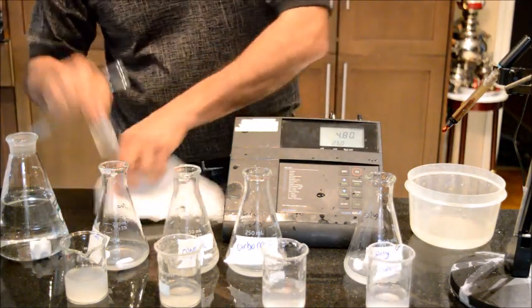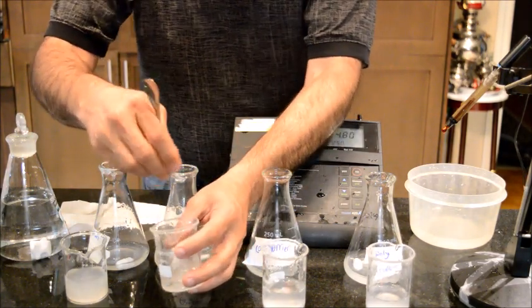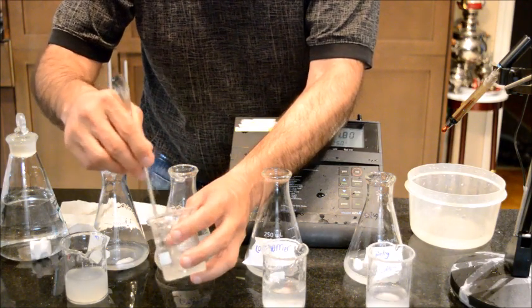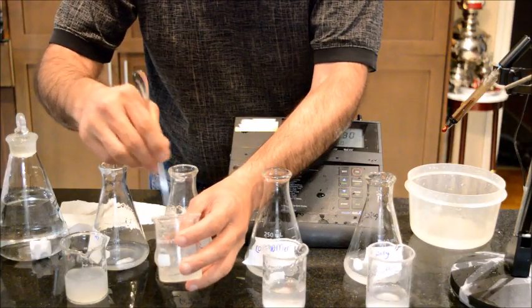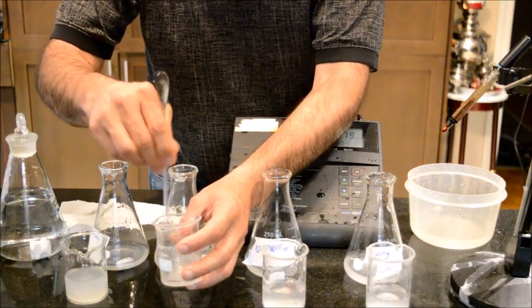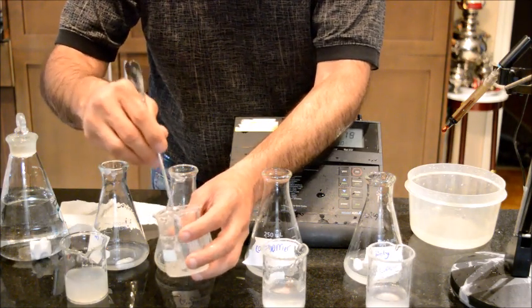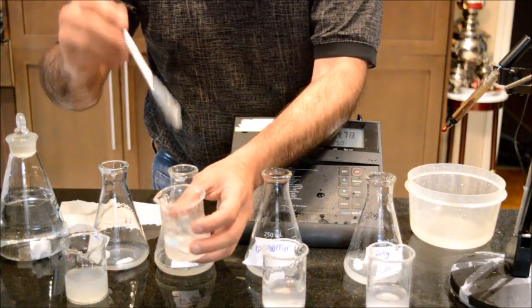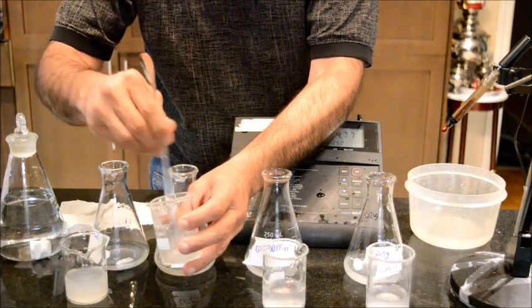I'm just going to switch to alginic acid, and in the case of alginic acid, it is rather picking up a little bit of viscosity. As I'm spinning, it becomes more and more viscous. I'll explain what is happening when I'm done mixing. As you can see, this material is actually thickening up very nicely.